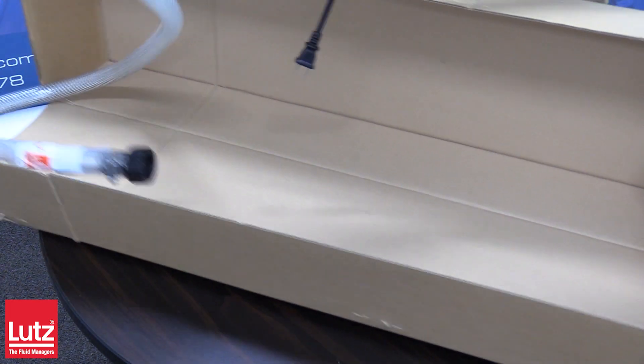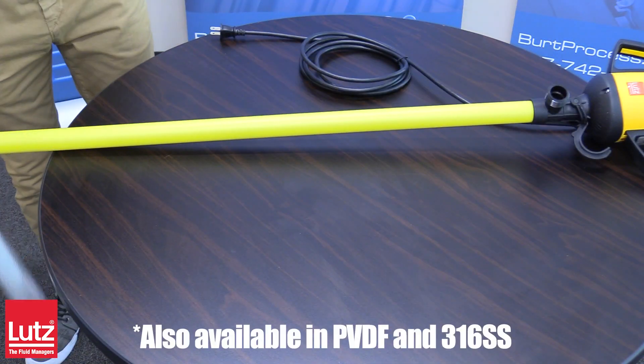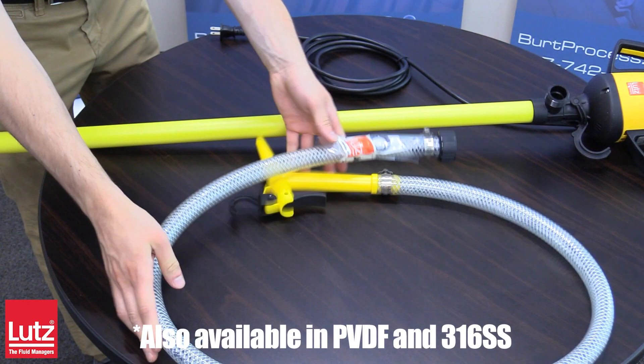The Polypropylene Laboratory B2 Vario Pump Set is a safe and economical choice for laboratory, research, non-flammable, and hazardous pumping applications. This specific model is polypropylene, however it is also available in PVDF and 316 stainless steel.